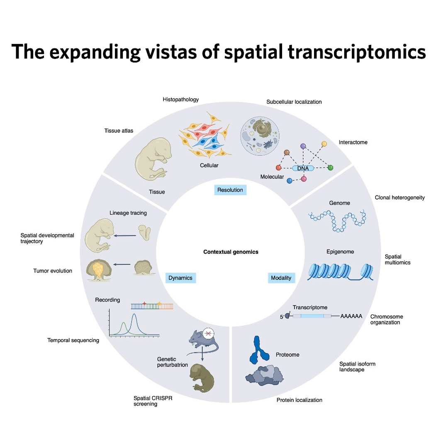What about IST then? IST, on the other hand, really grew out of the microscopy and cellular imaging world. Imaging-based IST aims to keep the RNA in situ, meaning right in its original spot within the cell or tissue. So no capturing onto a slide. Generally not, no. It detects the mRNA transcripts directly using advanced fluorescence techniques. Things like specialized versions of in situ hybridization, or even performing sequencing reactions right there on the slide while it's under a microscope. You're seeing the RNA in place. That makes the distinction really clear. It's capture versus direct detection.